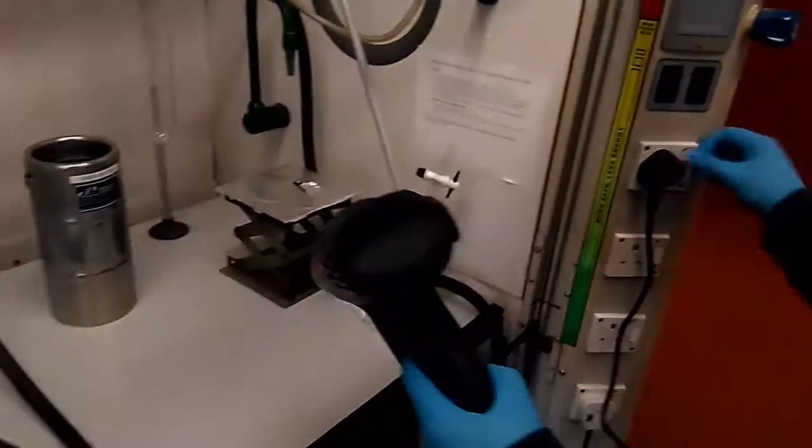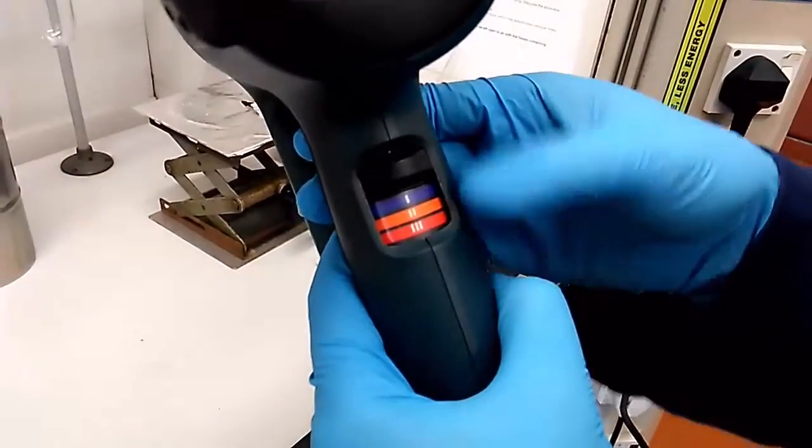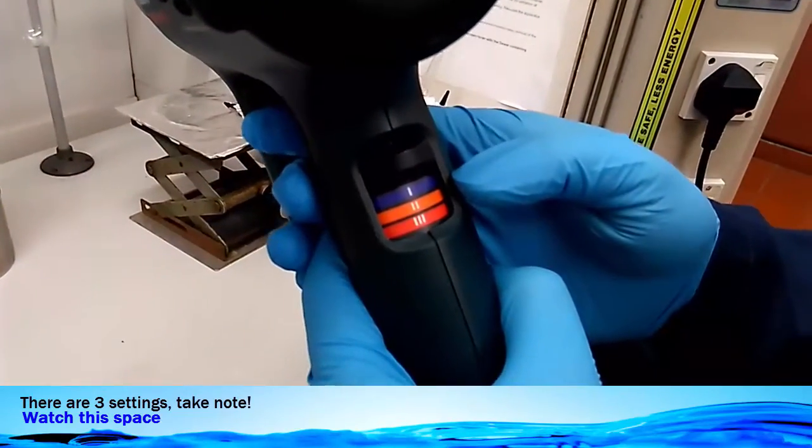This is a Bosch hot air gun, model GHG 600-3. Here you see three settings: setting number 1, 2, and 3.